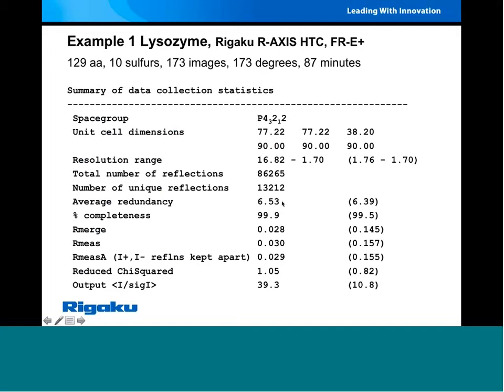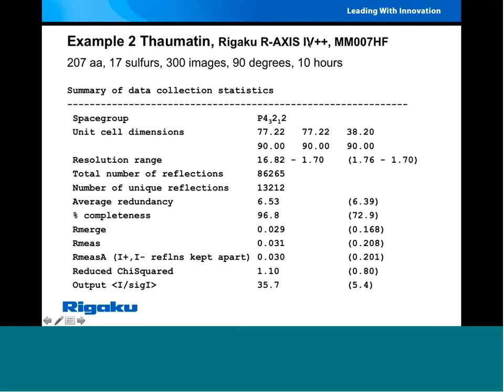We've done it with less than this and with shorter data collection times, but this is a data set I just collected in November, so I have it lying around. It was 87 minutes exposure time on an imaging plate system, collected at 1 degree per image.